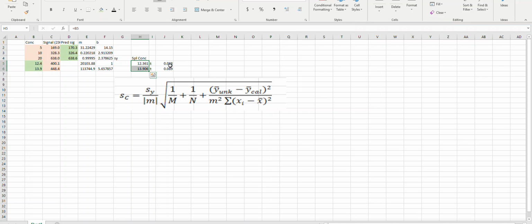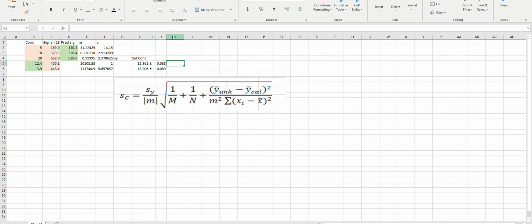Because right now 2 sig figs in this means that the thousands place is displayed. So we need the thousands place displayed here. So there we go. There's our uncertainty, right? Now we need to convert that, and the unit of this is ppm, right? And this is injected, right?